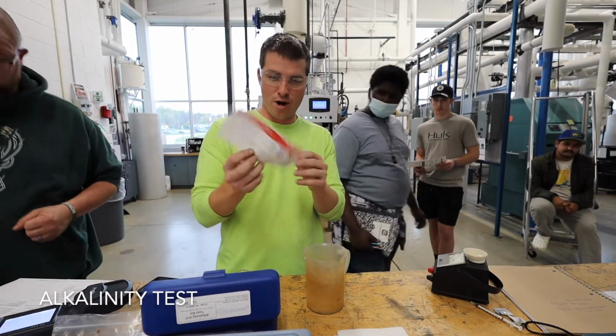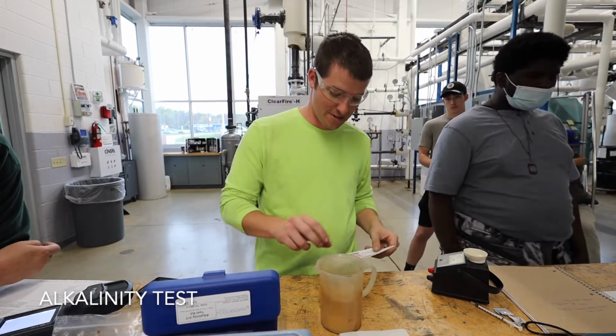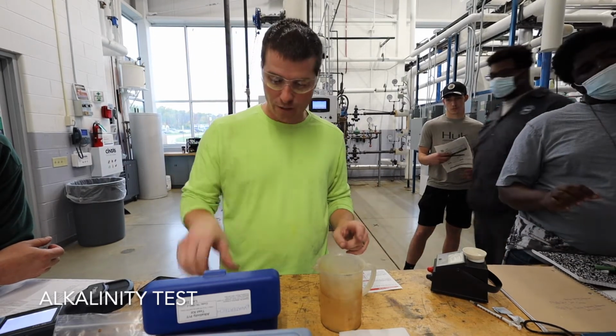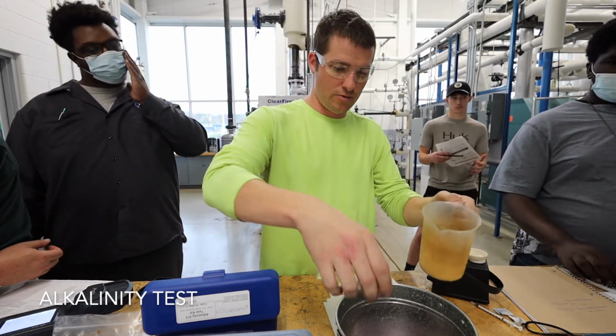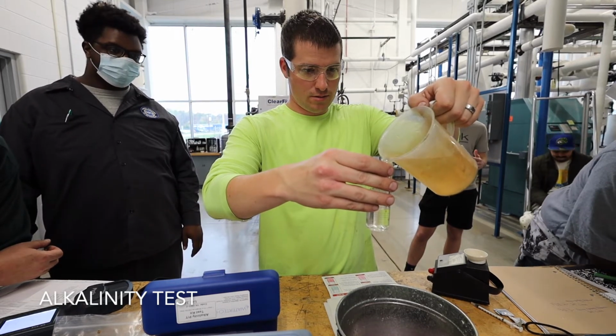Alkalinity tests. All right, we're gonna get confused. This is the most confusing test you're gonna run, simply because you have to remember what you did to go to the next step. So again, rinse this vial, fill it to the 25 mL line. It's brand new, but normally you would rinse it out. All right, so we'll fill up to the 25 mL line.